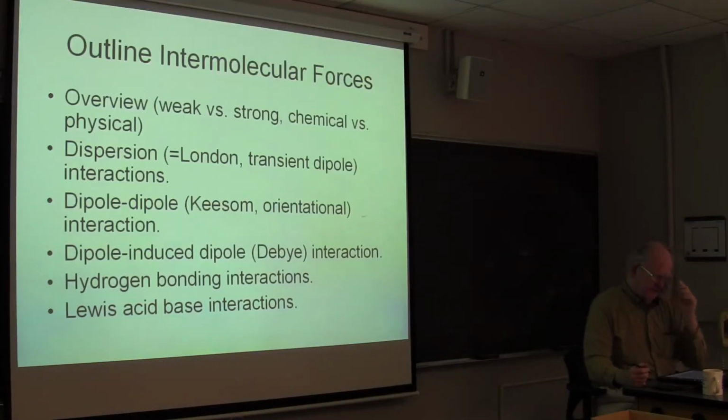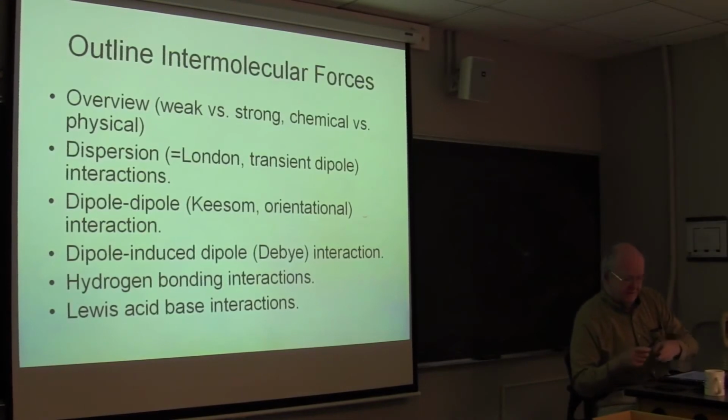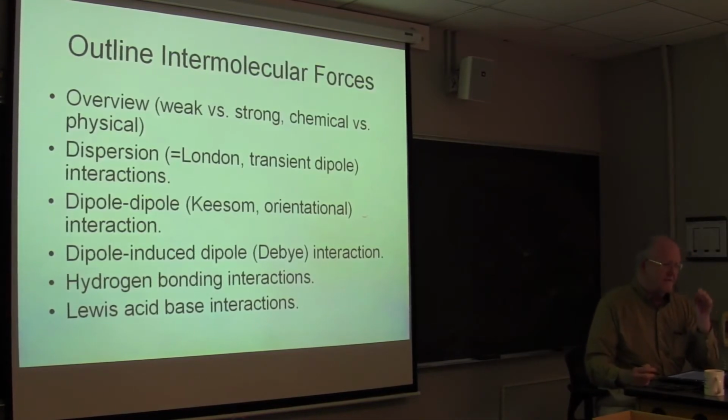Talking about intermolecular forces, we haven't been particularly chromatographic yet about where they come into play, but we will. It should be obvious that intermolecular forces are responsible for retention in chromatography. And the different kinds of intermolecular forces, which we've already introduced, give different kinds of chromatographic selectivity. That's why we have to get into some of these details.